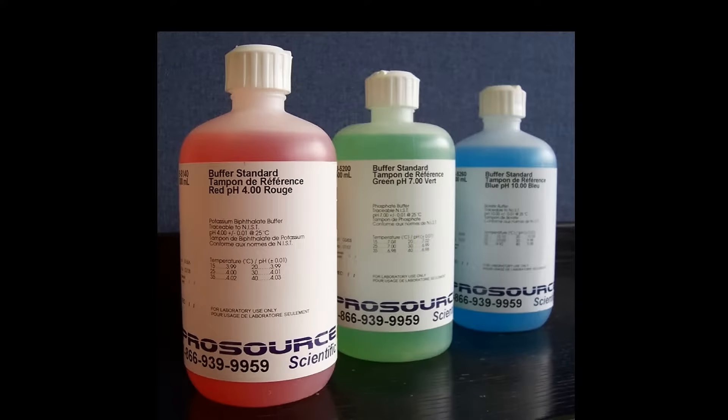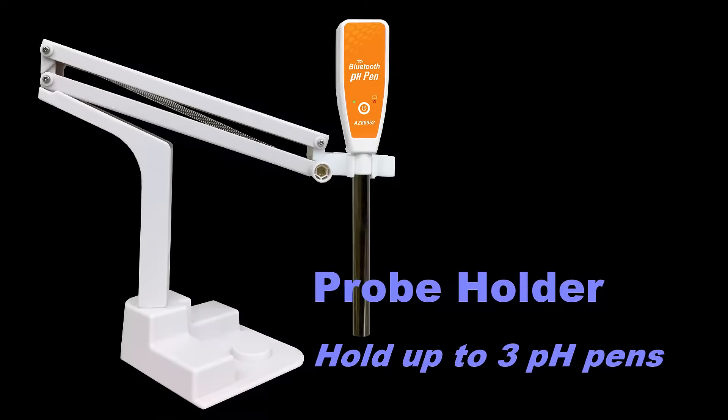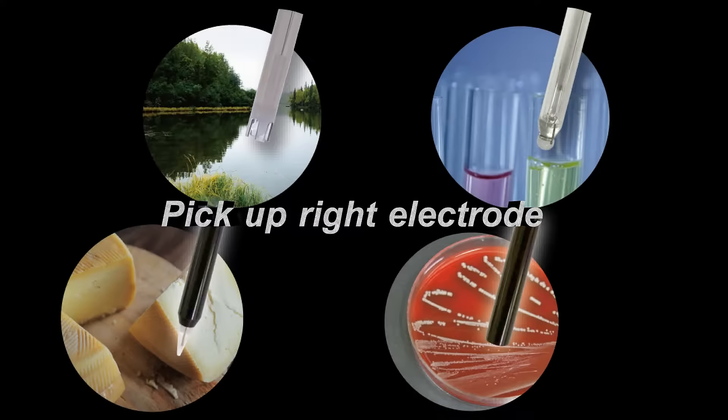Calibration buffer can be purchased locally. Probe holder is also an optional accessory. Pick up a right electrode for your measuring application.